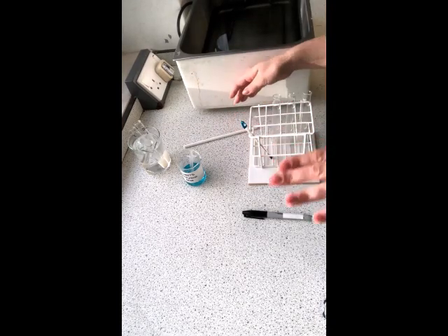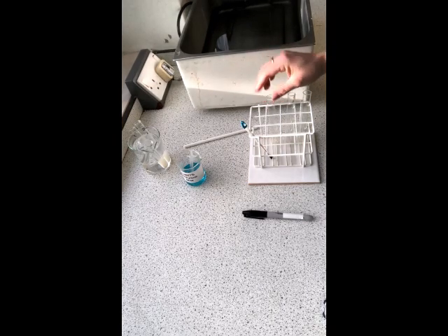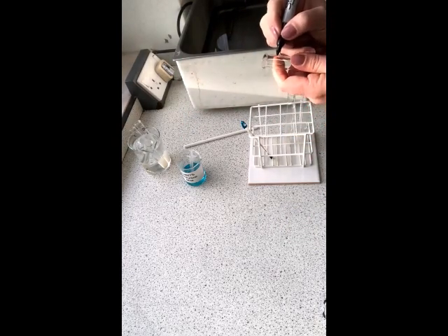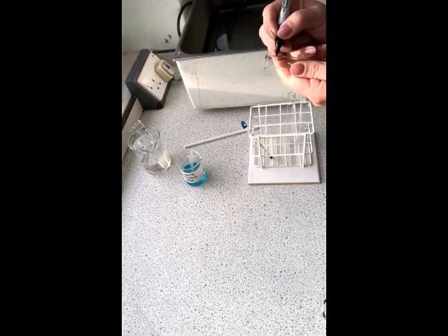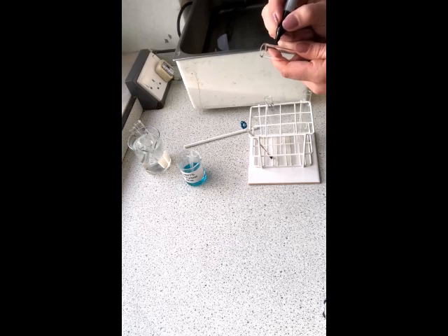So same thing again, we're going to take 2 centimetres cubed of the yeast and glucose solution. We're going to place it into these tubes. We are going to let them reach temperature for 5 minutes, and then we are going to add the methylene blue and see how long it takes for it to become colourless.